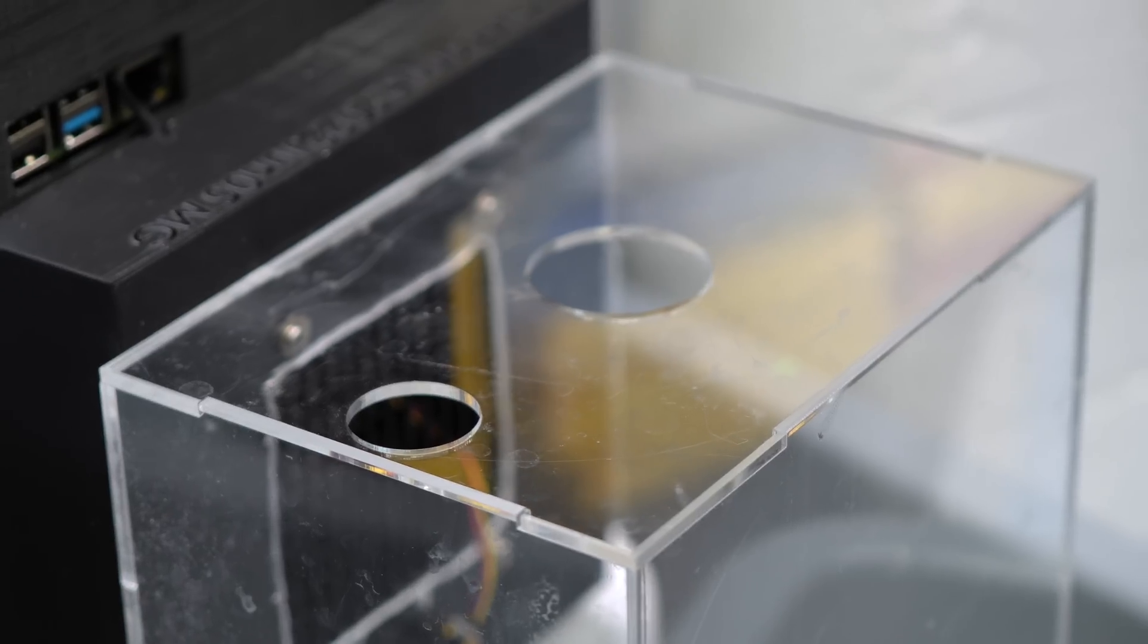So what is your background that led to being able to build something like this? I'm an electrical engineer, Kansas State University, 1983. And I was trying to make it robust. Phelan's original thing had a bunch of parts laying on the bench and I was afraid he was going to electrocute himself. So step one is I put it in a plastic box so he couldn't do that.